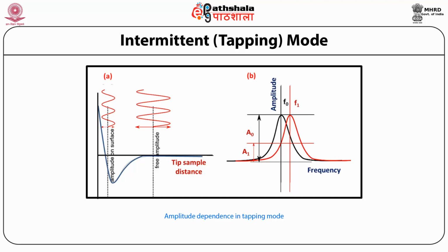Different components of the sample exhibit different adhesive and mechanical properties and reflect different phase contrasts that allow compositional analysis of the materials. For a good phase contrast, larger tip forces are an advantage, while minimization of this force reduces the contact area and facilitates high resolution imaging.